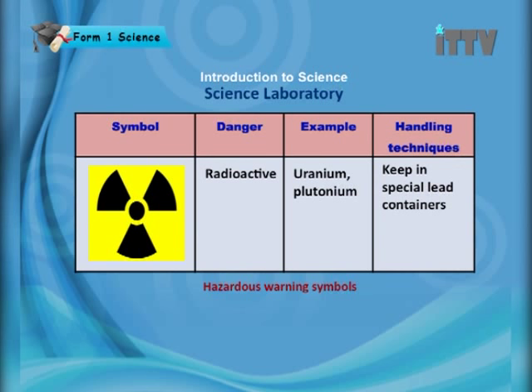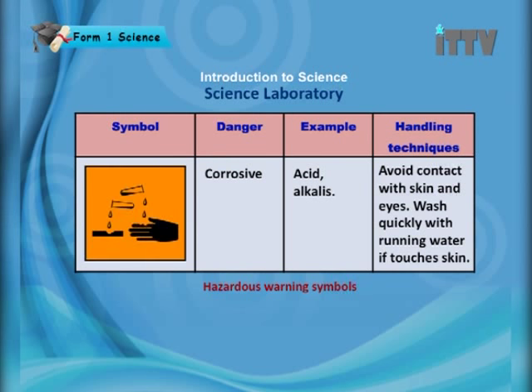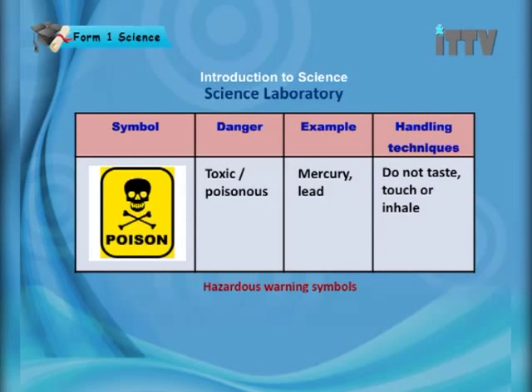The corrosive sign indicates chemicals such as acids and alkalis — for example, hydrosulphuric acid. Avoid contact with skin, and wash quickly with running water if it touches skin. The poisonous or toxic sign indicates substances such as mercury and lead. Never put any chemicals into your mouth while in the science laboratory. Do not taste, touch, or inhale these substances.